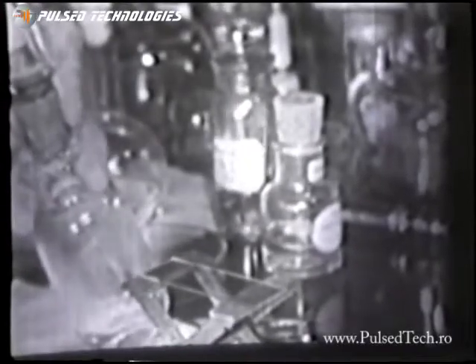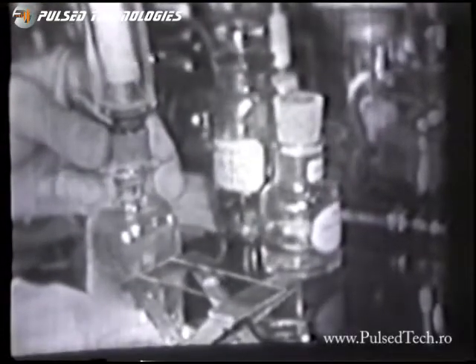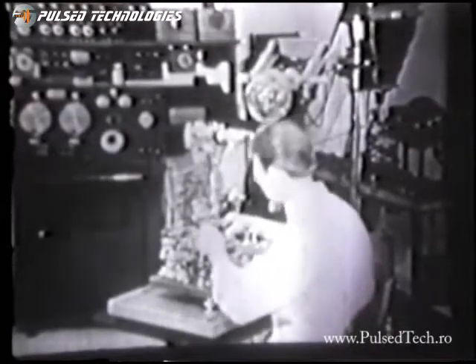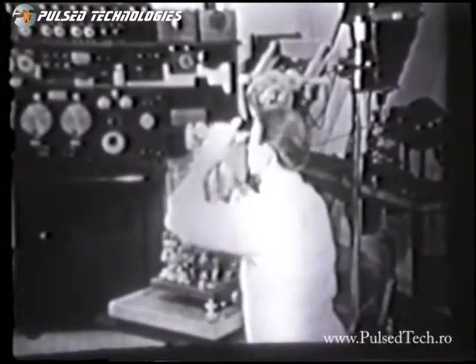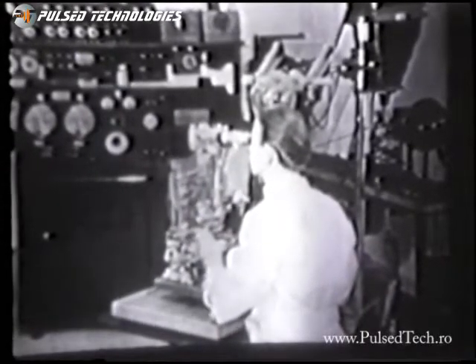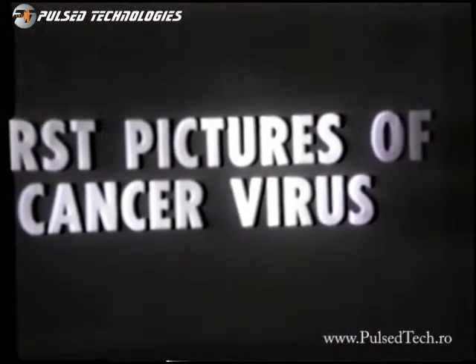The liquid material is withdrawn with a micropipette made by Rife into the solution, and a drop is placed on the slide and covered with a cover slip made of quartz. Rife used quartz slides because the light passed through better than glass. Now the ray tube is above Rife's head, which will be turned on later to kill the virus. The instrument to the left of Rife, the black instrument, is a ray tube instrument. It consists of a transmitter and an audio oscillator in which Rife could tune the frequencies which he knew would kill the virus, just like a voice would crack a glass.